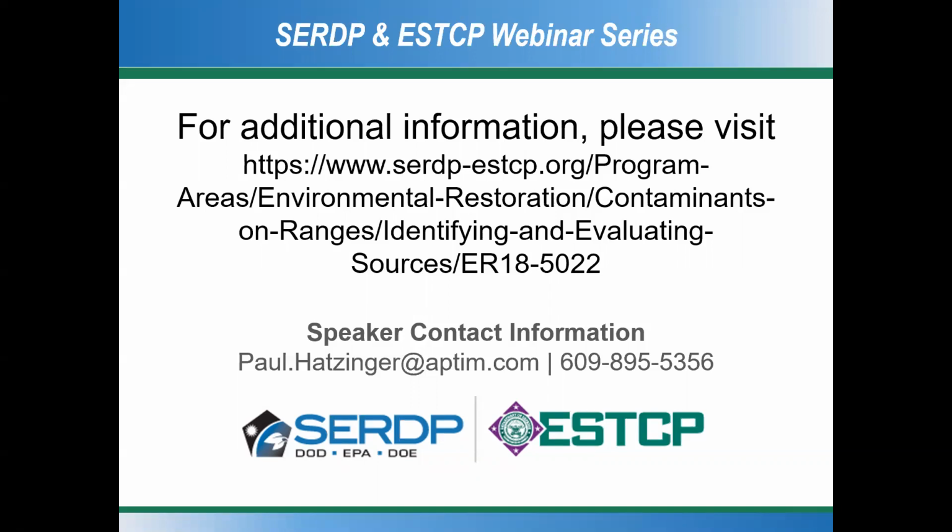Another example again is cis-DCE stall for chlorinated ethene sites. Is cis-DCE biodegrading? I showed you that can be tricky, but again, with the correct interpretation, you can gain data and potentially supportable data to show that, yeah, in fact, degradation is occurring, and maybe this is a natural attenuation situation rather than having to do an active remedy and the costs associated with that.